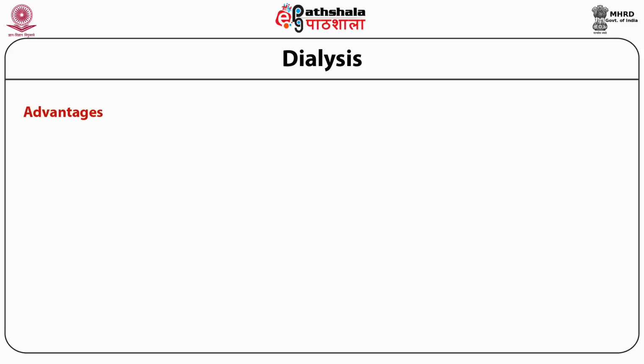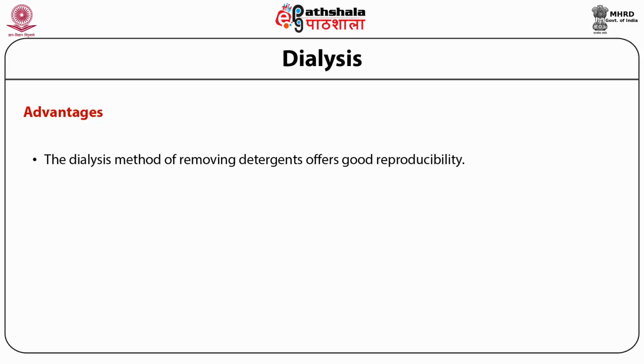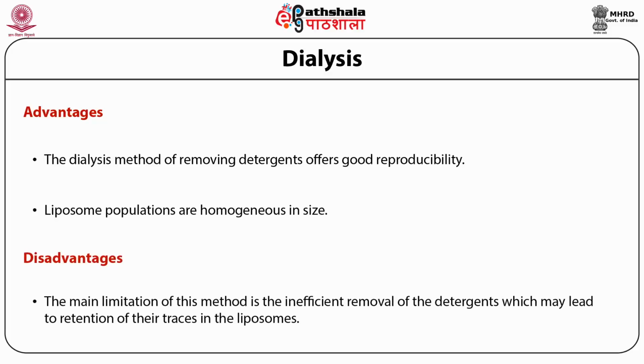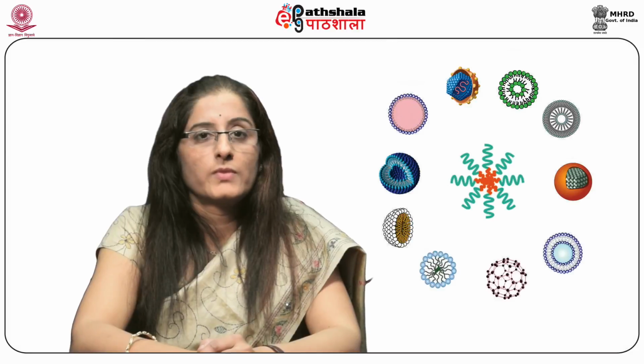Advantages of this method: the dialysis method of removing detergents offers good reproducibility. Second, liposome populations are homogeneous in size. Disadvantages of this method: the main limitation of this method is the inefficient removal of detergents, which may lead to retention of their traces in the liposomes.